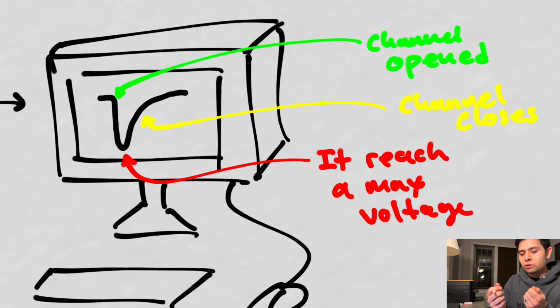If I add a partial agonist or some sort of antagonist, then this curve is actually going to change. If you're doing your experiment carefully enough, the rate at which the channel closes is basically what you're measuring. And so you can add chemicals to your solution to speed it up or to slow it down. You can add chemicals that render it completely open.